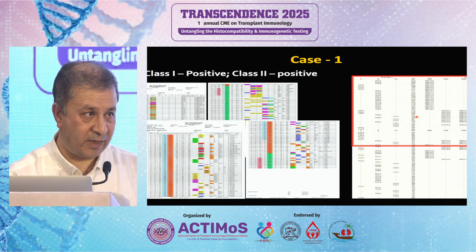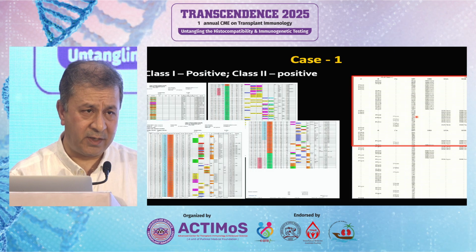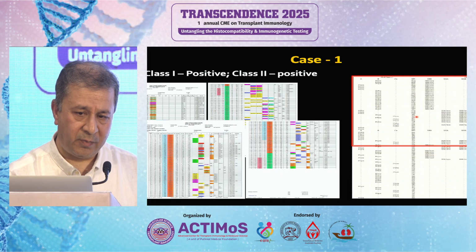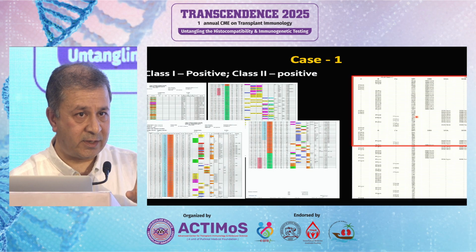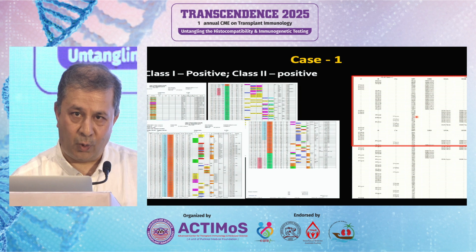The question was whether there was relevant antibody or not. In this particular case, it was significantly relevant. It's a different story. We didn't go ahead with the transplant, and in any case, the patient succumbed later on, just about 2 months later. But nevertheless, the idea in this case to tell you was that please don't ignore what is coming from different tests. All tests will give you different reactions, and there will be variability in reactions depending upon who's performing the test also.